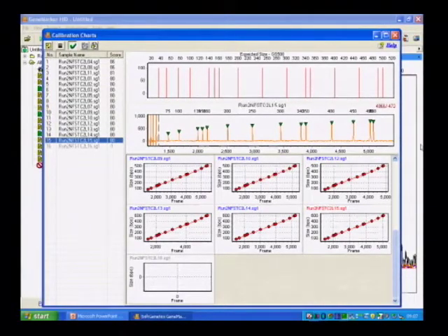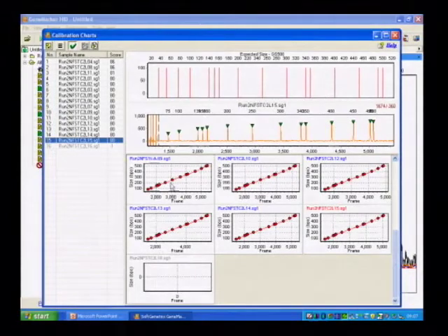This is just a quick quality check, at least when we run the software, to make sure that the alleles will be called properly and not miscalled as a function of improper designation of the sizes by the software. You'll see we turned on the 250 and also the 340 peaks included in our sizing.